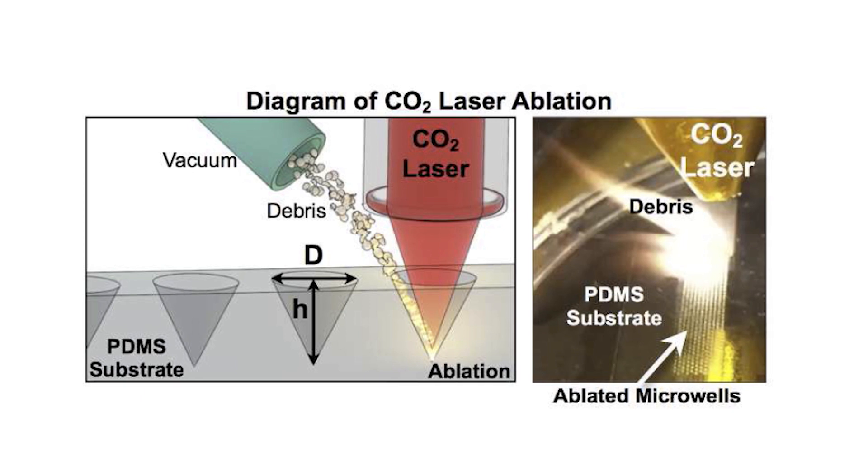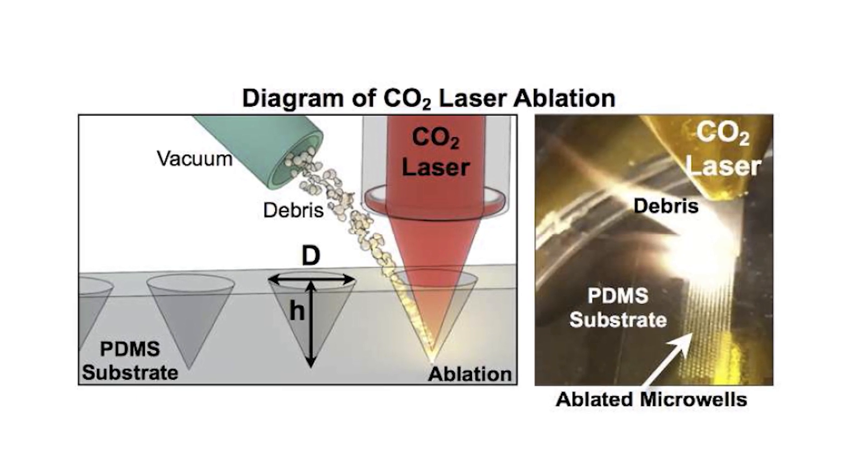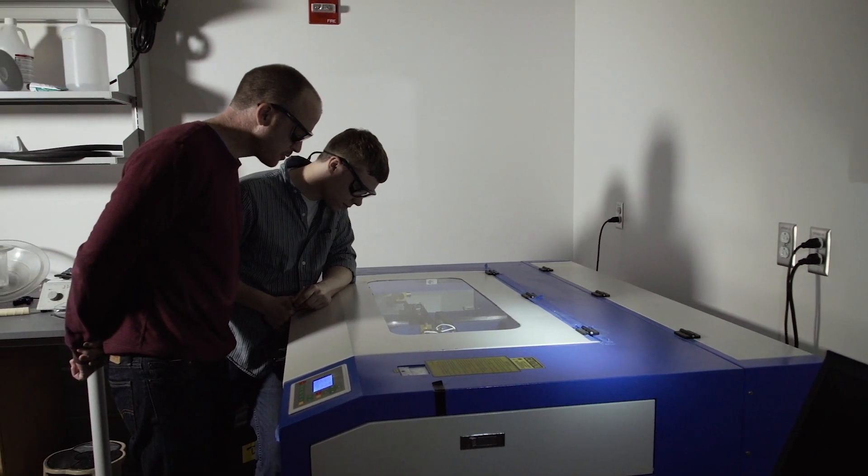We've added different Z depth where we can get different areas of the laser. At the focal plane you have a small hole, and then you can get larger diameter conical depressions by changing the Z axis. This is how we've expanded on the technology.